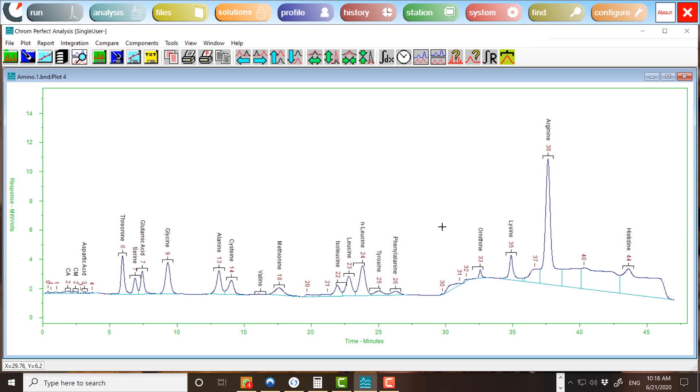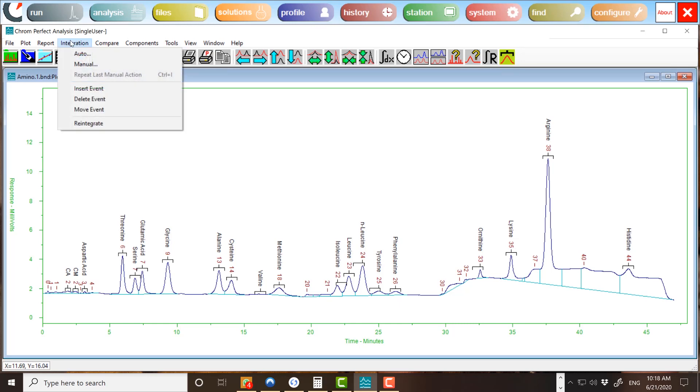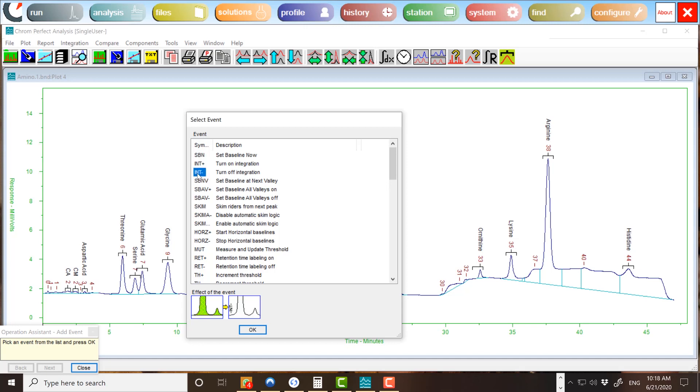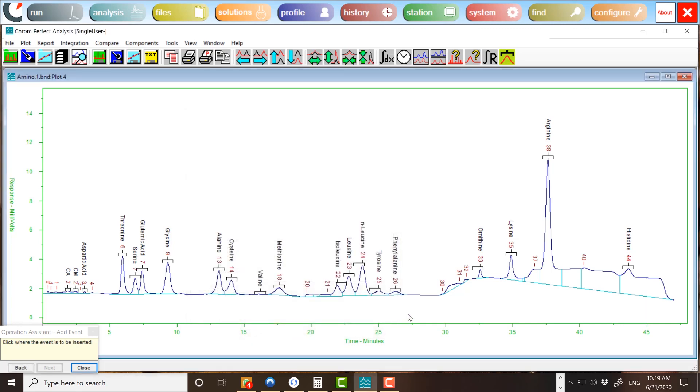Let us look at automatic integration and how we add timed events to a chromatogram. To add a timed event, choose Integration Insert Event. The operation assistant and the following form will appear. This form lists the event types. The five most recently used types will appear at the top of the list. As you select from the list, the area below changes to indicate the effect of the event on the chromatogram. To select an event, press OK or double-click on the desired event in the list.